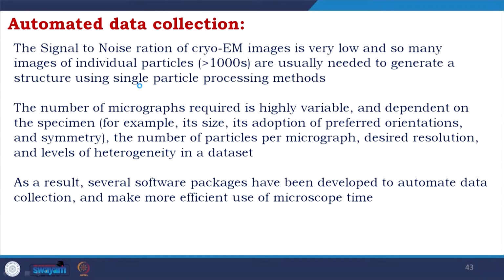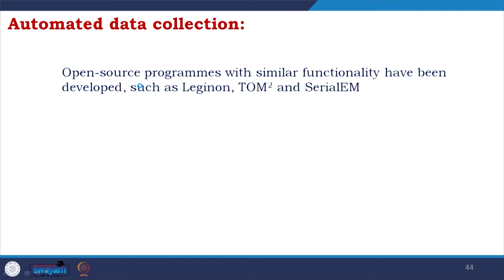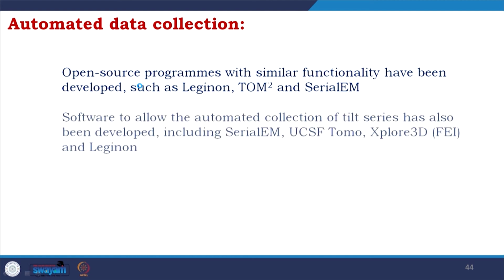As a result, several software packages have been developed to automate data collection and make more efficient use of microscope time. One commonly used package is FEI's automated data collection software EPU, or E Pluribus Unum. Open source programs are also available with similar functionality, such as Leginon, TOM 2 and SerialEM.